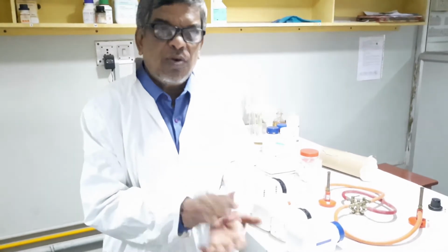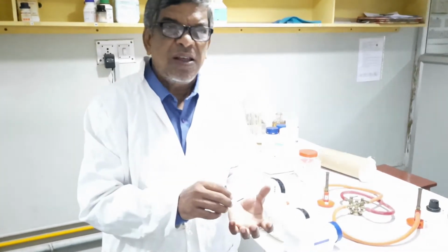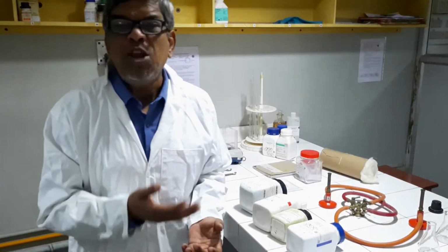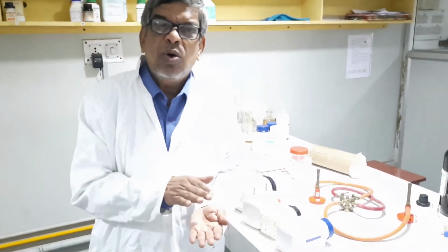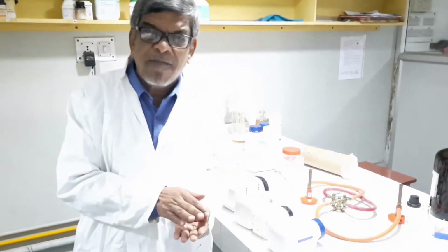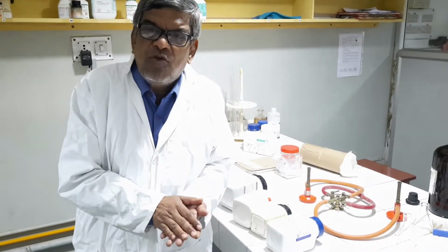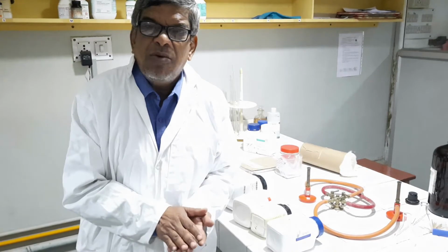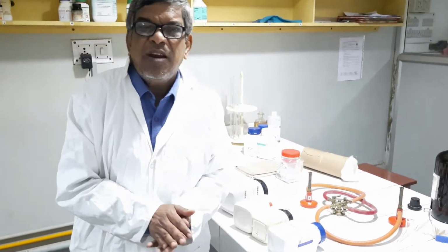So we will autoclave the agar-agar containing medium, shake it and pour it in a petri dish. Only after pouring into the petri dish will we keep it in a cool place, that is in a BOD incubator or bacteriological incubator. Incubators are of two types, bacteriological incubator and biological oxygen demand or BOD incubator. After that it will be solidified.